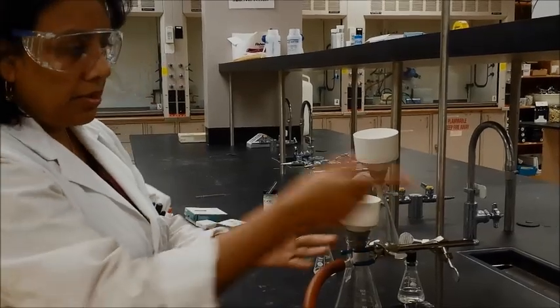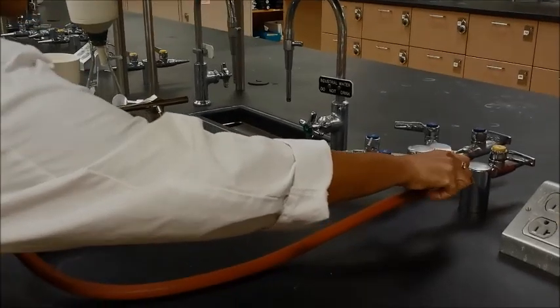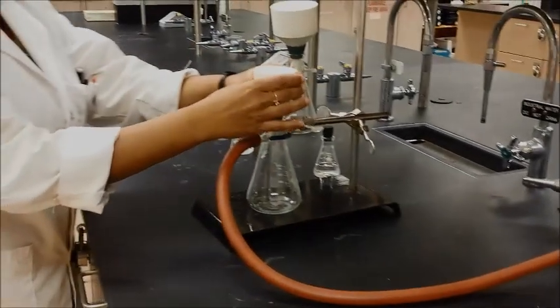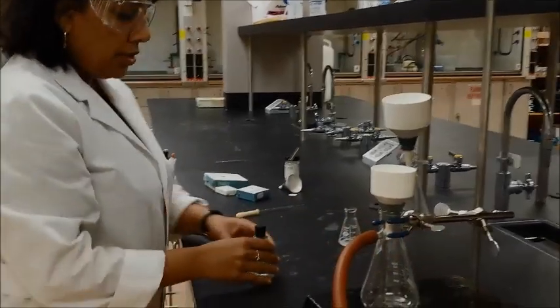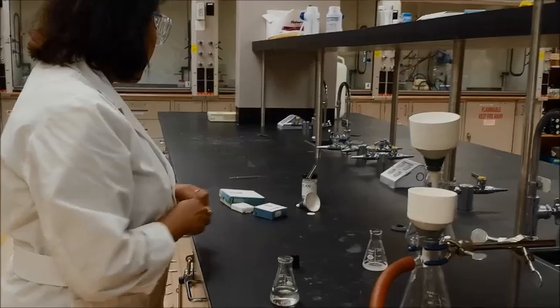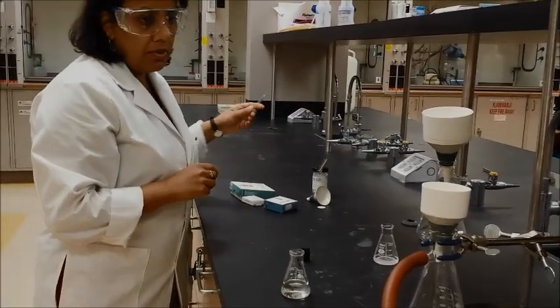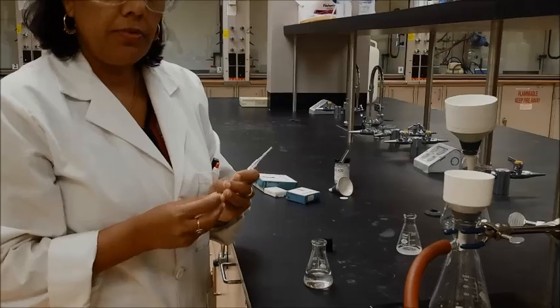Once your Buchner funnel is all set, then what you need to do is turn on the vacuum. And hopefully, you can hear the vacuum. So, things are now getting a little bit set on the vacuum. Then what you need to do is you need to make sure that the filter paper actually sticks onto the Buchner funnel. So, what you will need to do is get a little bit of your solvent that you're using for filtration purposes.